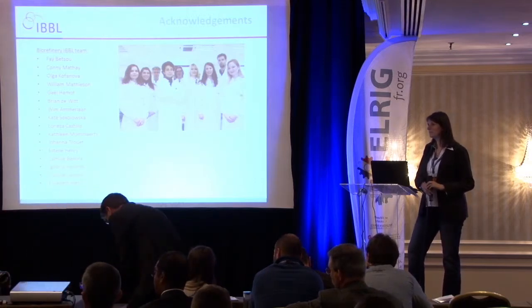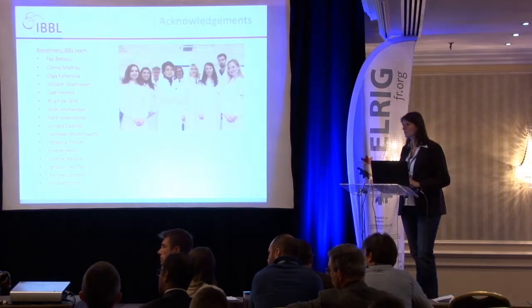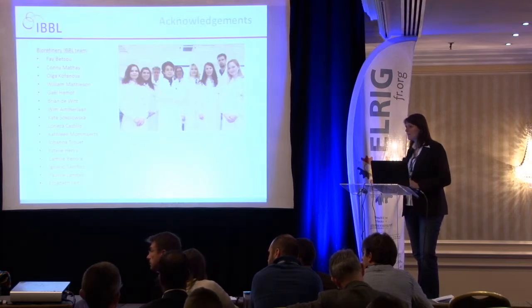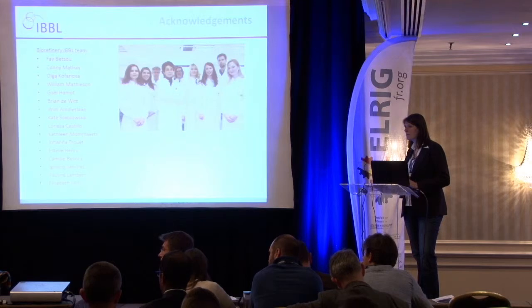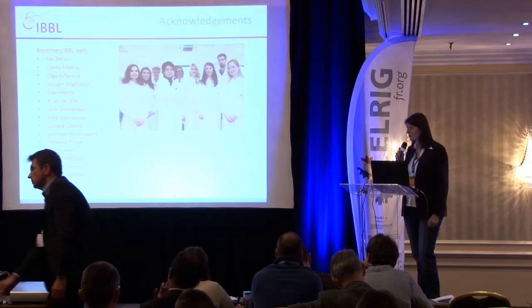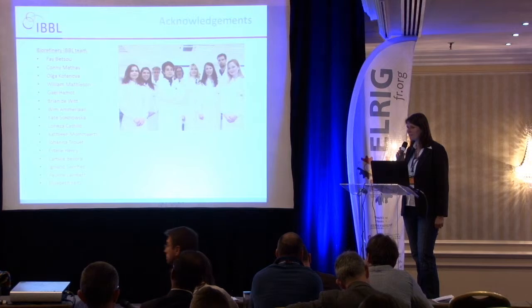Do you have any experience in extraction of stem cells from umbilical cord? In some countries, I think it's forbidden, but I don't know in Luxembourg. No, for the moment, actually, we don't do this. It's a very interesting field, I think, for everyone. But for the moment, we are not doing stem cells from cord blood.